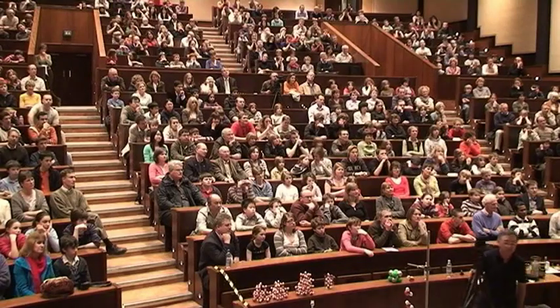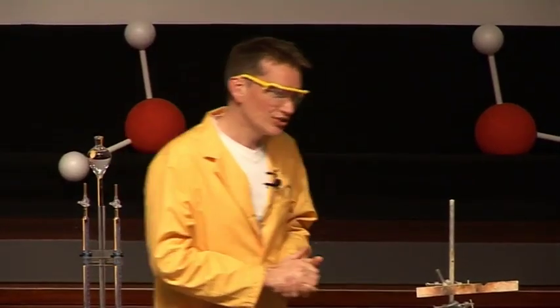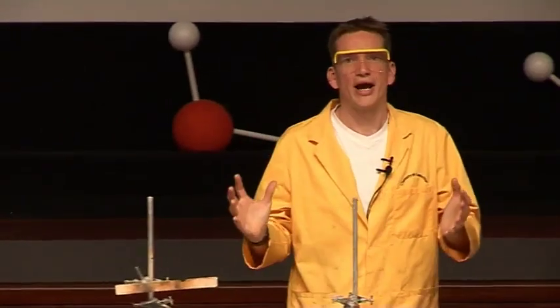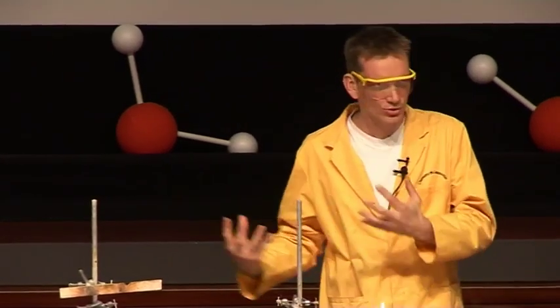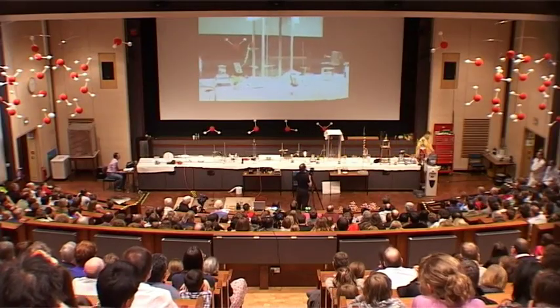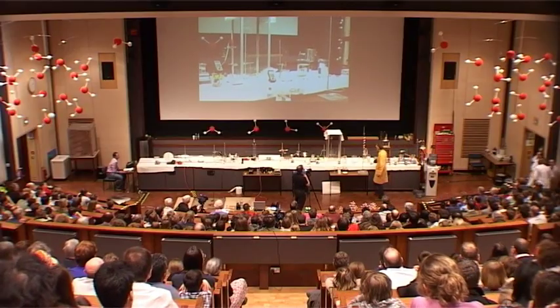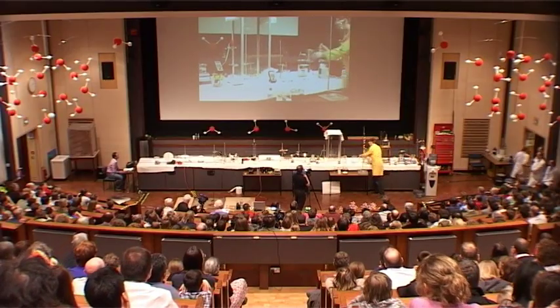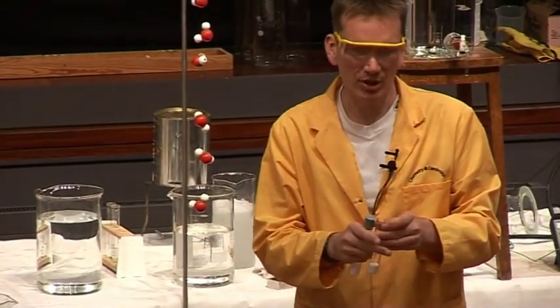Okay. Now, water then, essential for reactions to take place. Most reactions take place in solution, and most reactions in biological things, of course, take place in water. It's very unusual to see reactions take place without a solution, without water there. Now, I do have an example to show you of a reaction between two solids which takes place without any water. So I have two solids here.